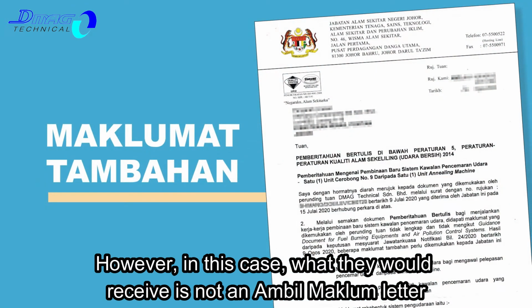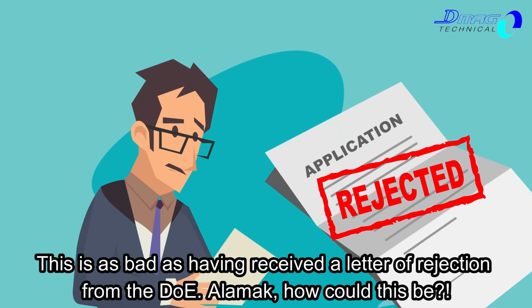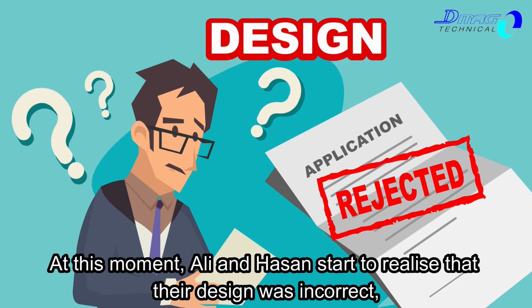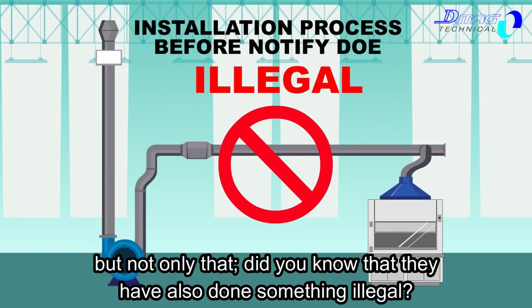However, in this case, what they will receive is not an Ambil Maklum letter, but instead a Maklumat Tambahan letter, or a letter requesting additional information. This is as bad as having received a letter of rejection from the DOE. Alamak, how could this be? At this moment, Ali and Hassan start to realize that their design was incorrect, but not only that. Did you know that they have actually also done something illegal?